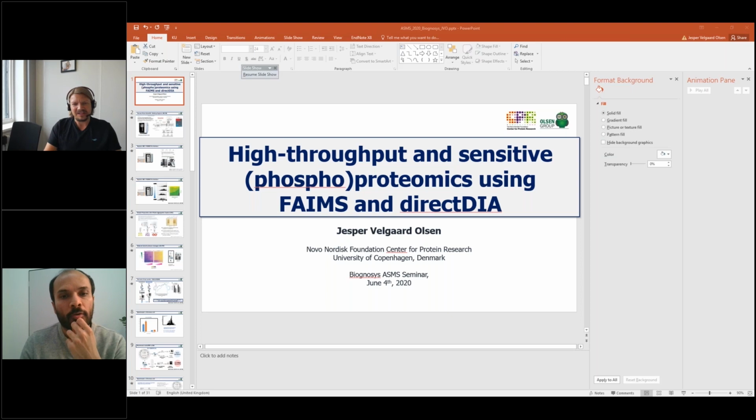Yeah, but we are actually quite intrigued now by this new data, especially from the 44-minute analysis, that it seems like even 3 CVs work better than just 2 CVs. But I guess, I mean, this is very fresh data, and we have to look a little bit more into it.